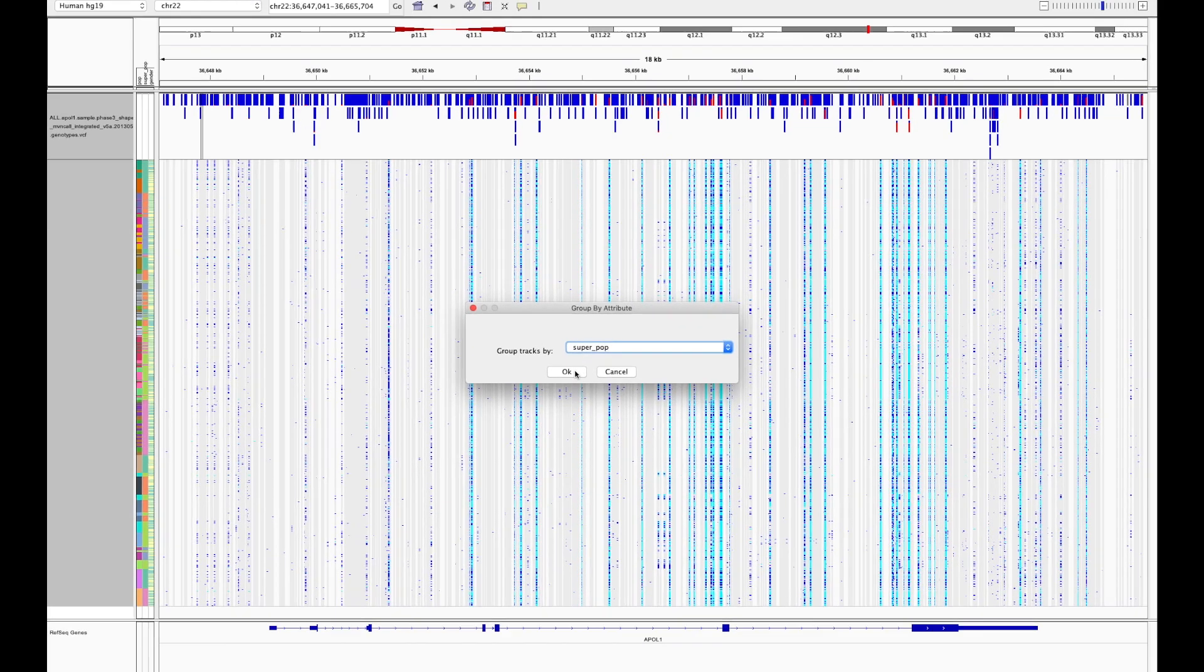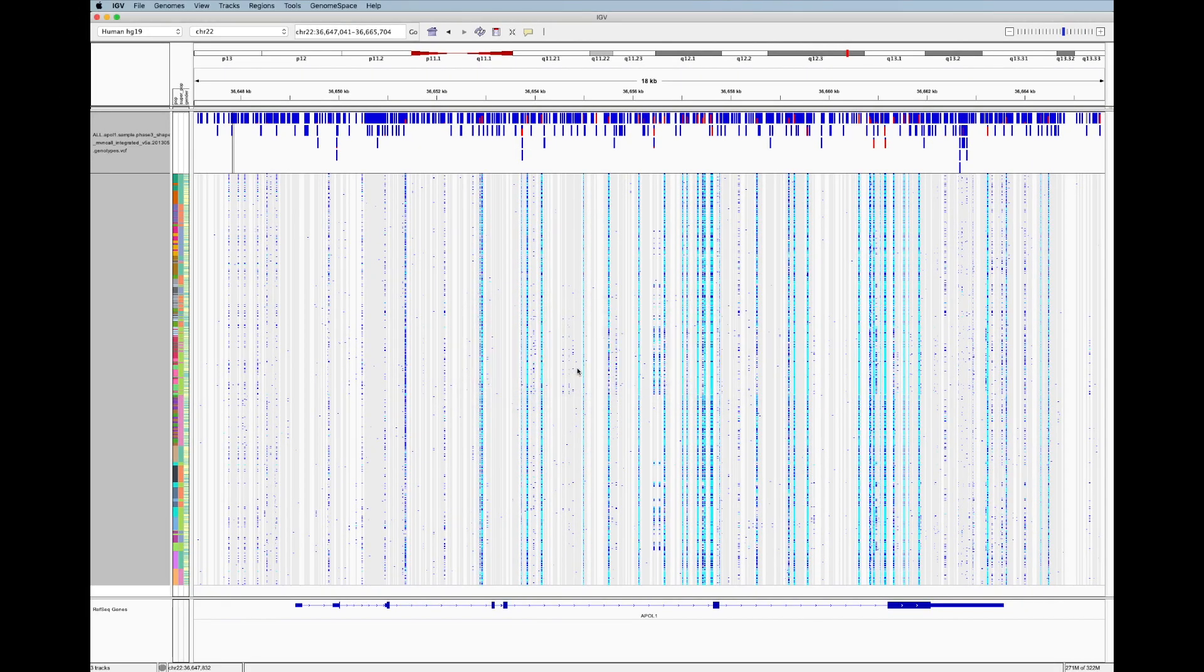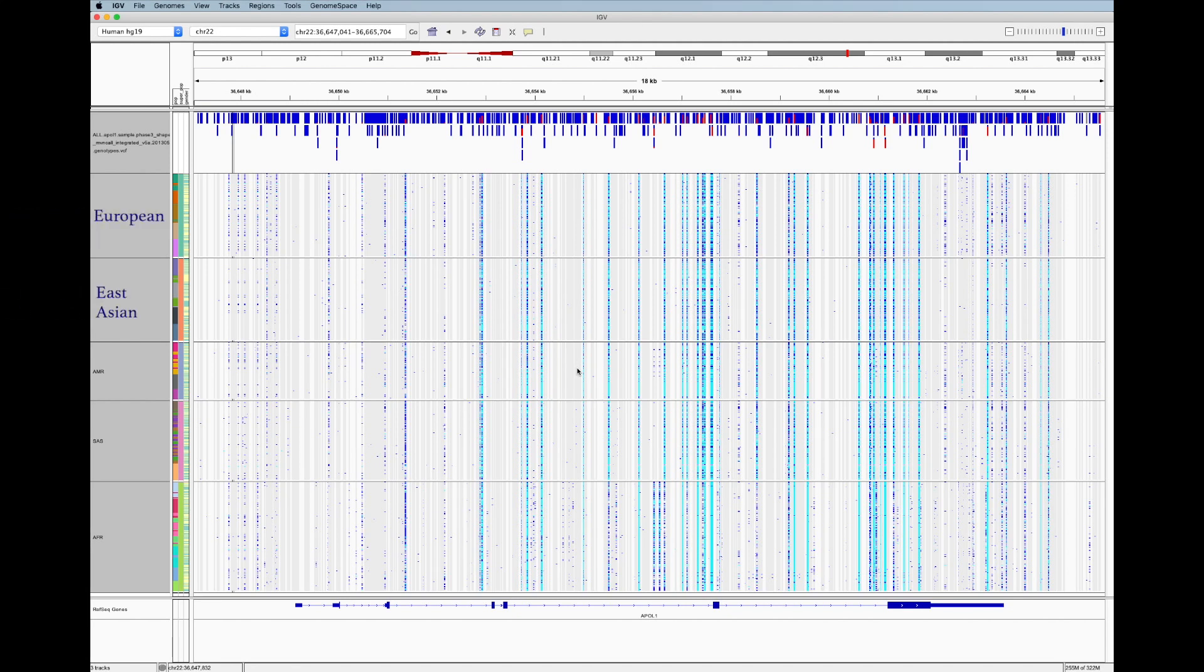When we do this, each of our superpopulations gets a section of data. These superpopulations are European, East Asian, Mixed American, South Asian, and African.